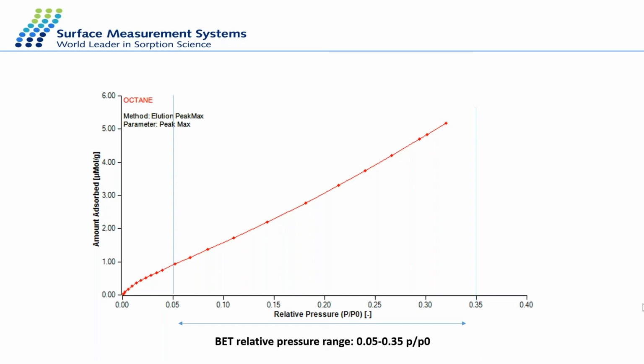Higher temperature can help, but if it does not help, then probably it's really chemisorption. So you have to choose another probe for the analysis.